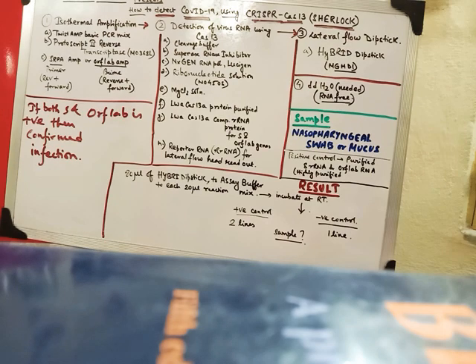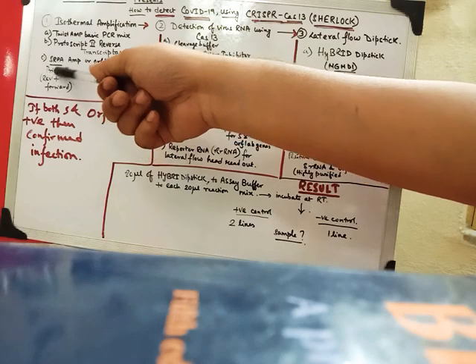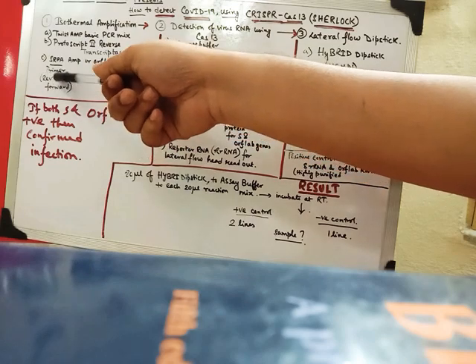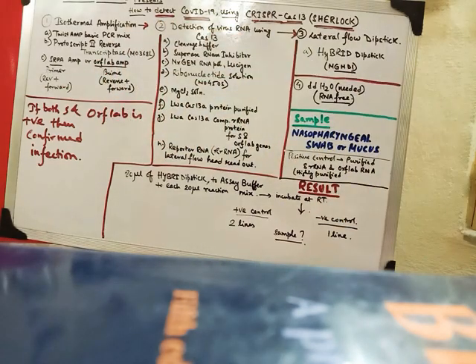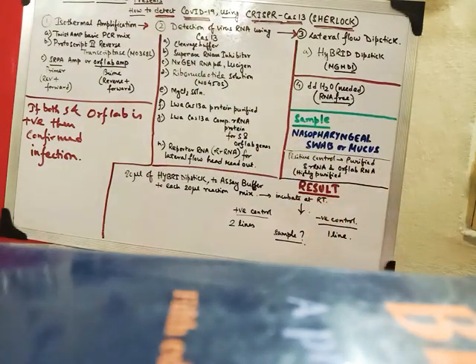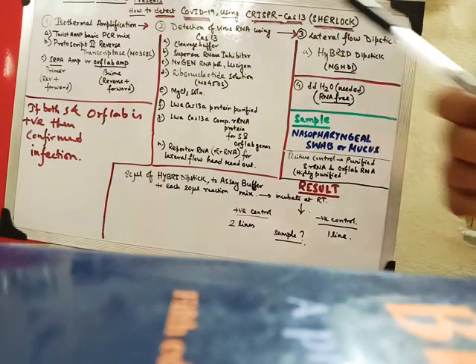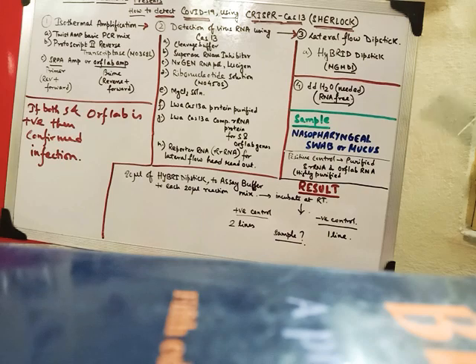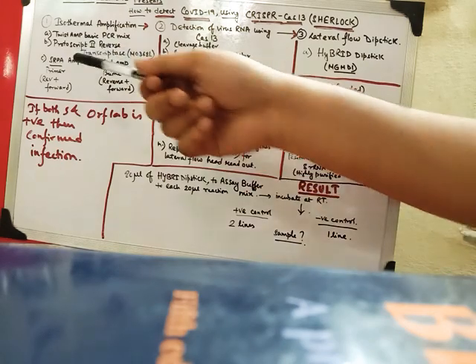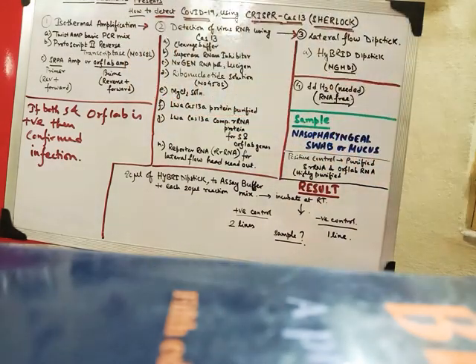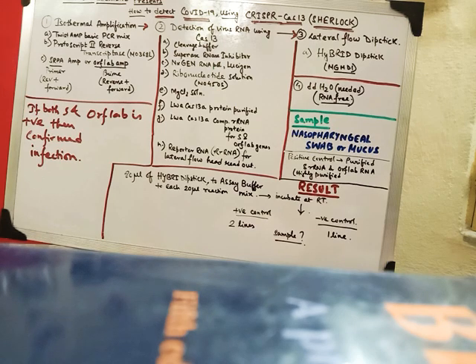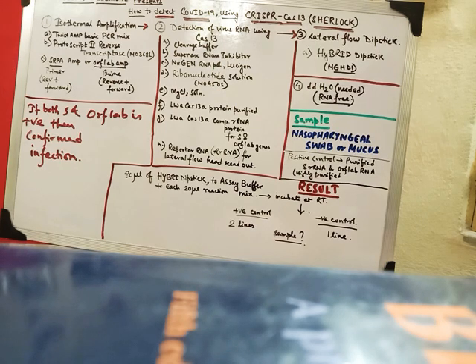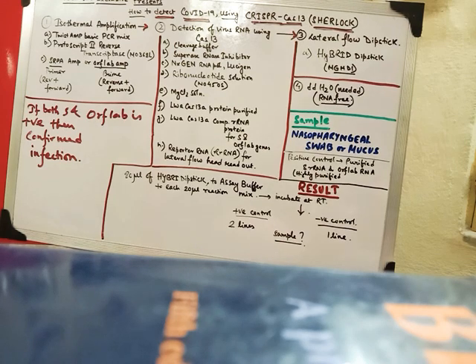Along with that we add SRPA forward V1. That is this one. Reverse and forward primer. The forward we add 0.5 microliter. And the reverse also 0.5 microliter. We also have the protoscript reverse transcriptase with an enzyme. So this is the protoscript reverse transcriptase enzyme. The concentration is around 100,000 micro units enzyme activity units per ml.